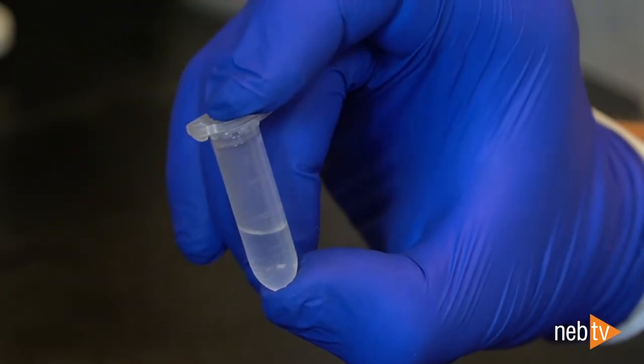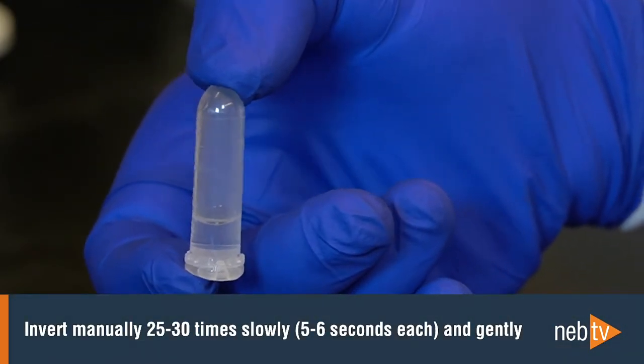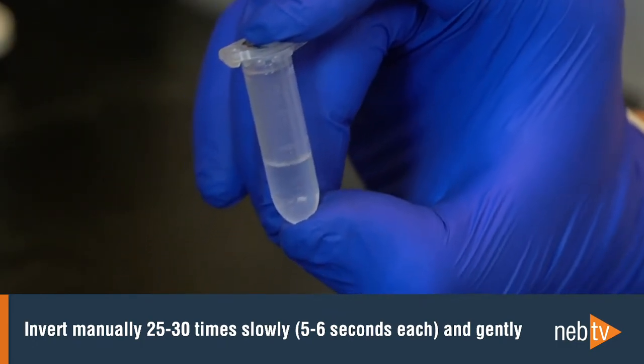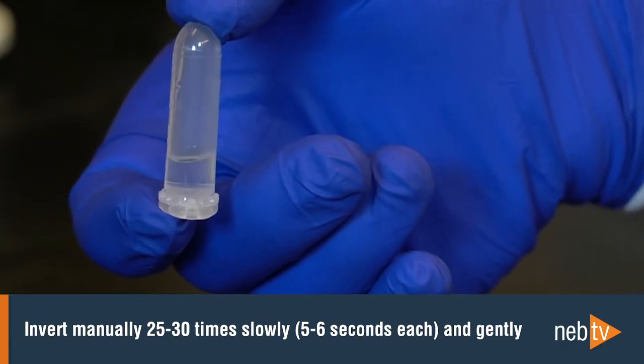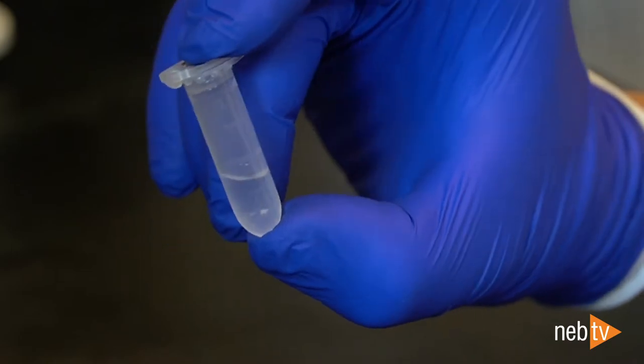If you don't have access to a vertical rotating mixer, you can invert the sample manually 25 to 30 times, slowly and gently. A manual inversion is complete when the tube returns to the upright position, and each inversion should take 5 or 6 seconds. If you carry out the inversion slowly enough, no beads will stick to the bottom of the tube.